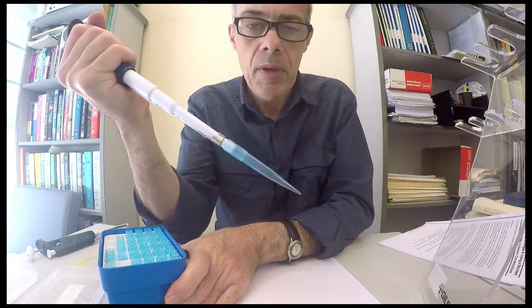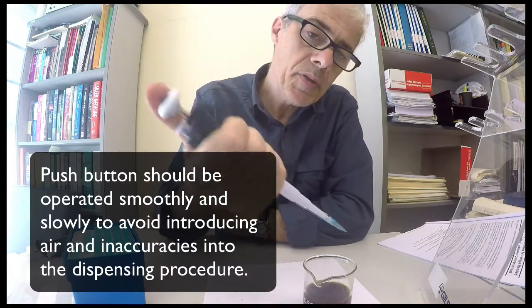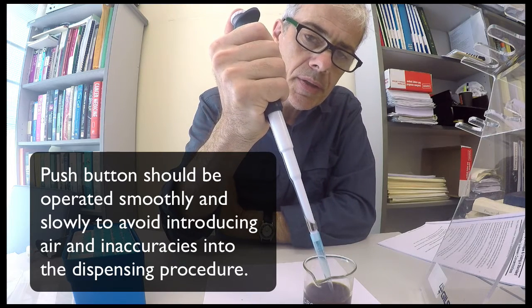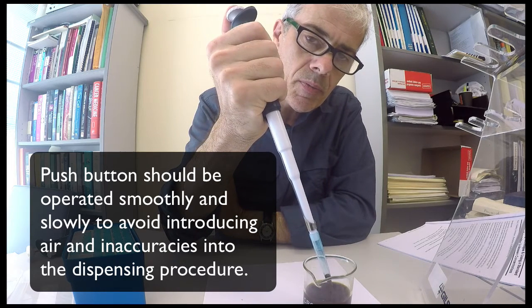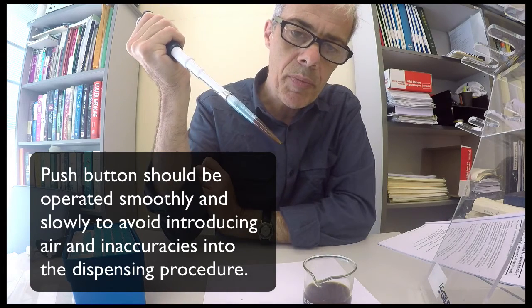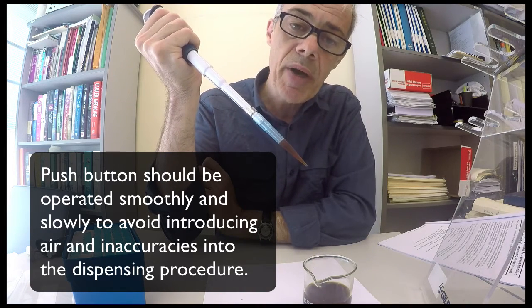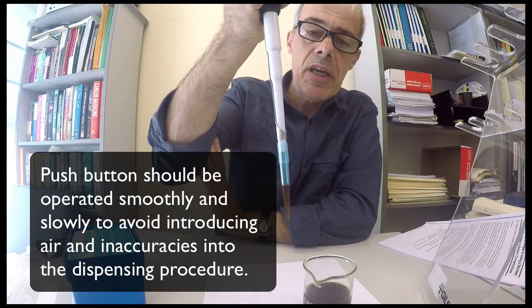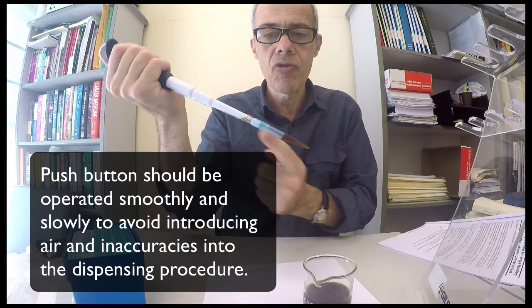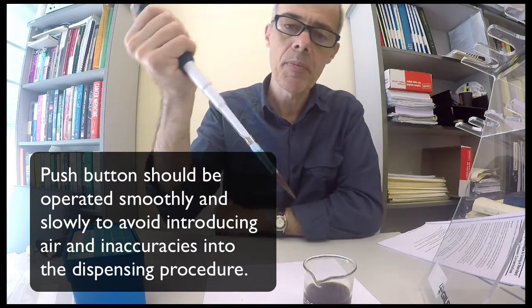Simply place your tip down to the first position here. Immerse. Slowly relieve the pressure on your thumb to draw up the 500 microliters. Keep the pipette in the vertical orientation to avoid the solution running up into the pipette.